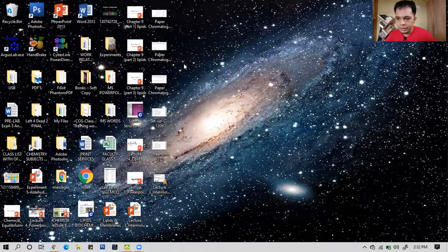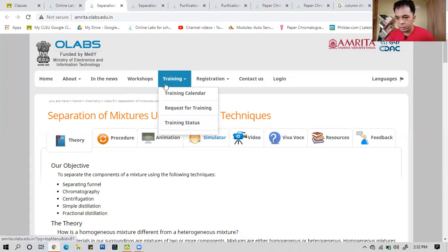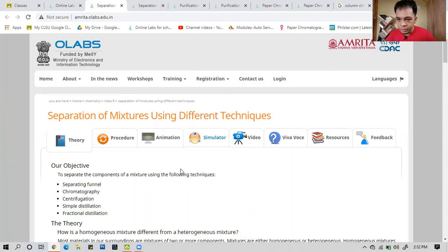This is part 3 of our lecture in module 3 in our subject, organic chemistry. Now, the discussion that will take place here, guys, is the explanation behind our experiment, or the methods of separation, which involves three different separations. Those are distillation, crystallization, and paper chromatography.